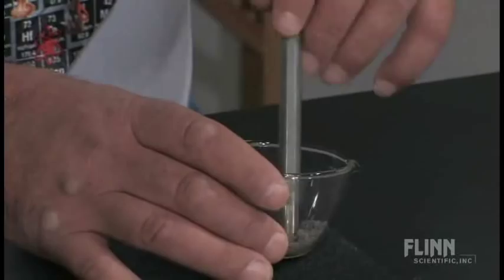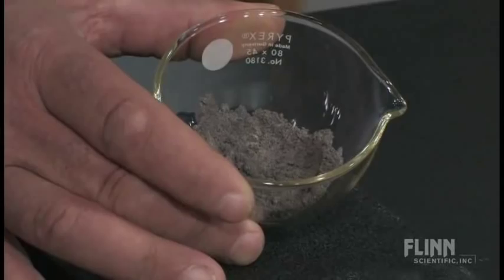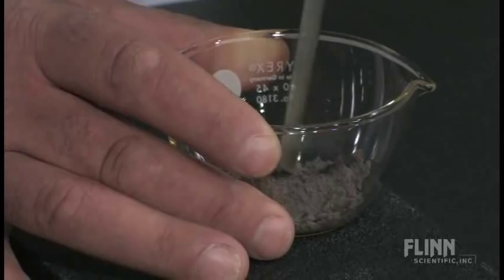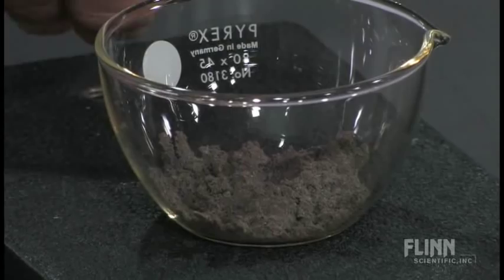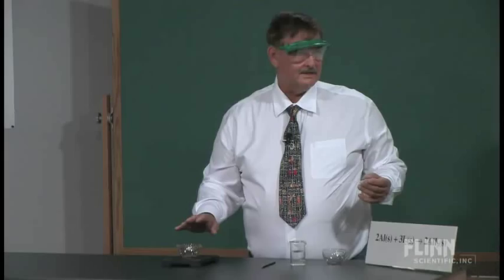I don't know if we can get a little close-up to see them, but the iodine and the aluminum, it's already starting to change color a little bit. What I like to do is I like to mound this up, and make a little kind of like a little hill of it, so I'll lay it flat so I can do that, and then make a little depression down in the center so I can add the water. It's already starting. I haven't done anything to it yet. That's why you don't want to pre-mix these ahead of time.